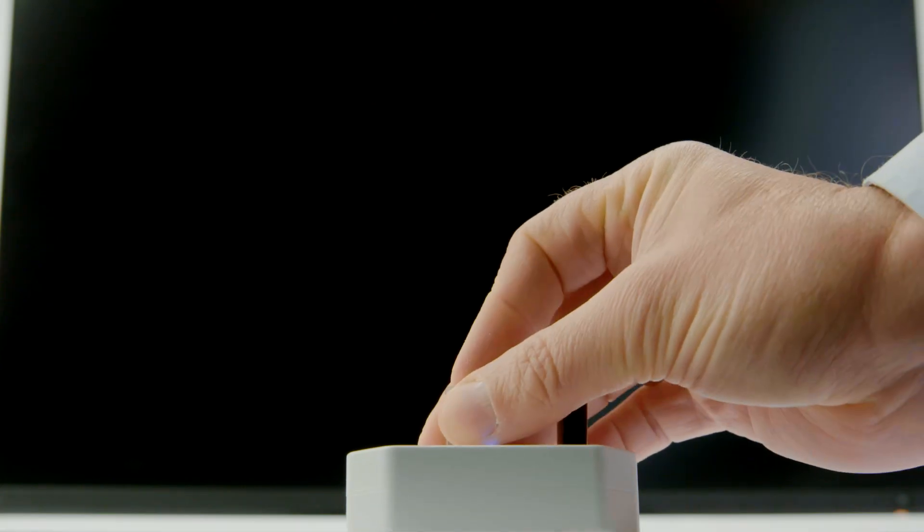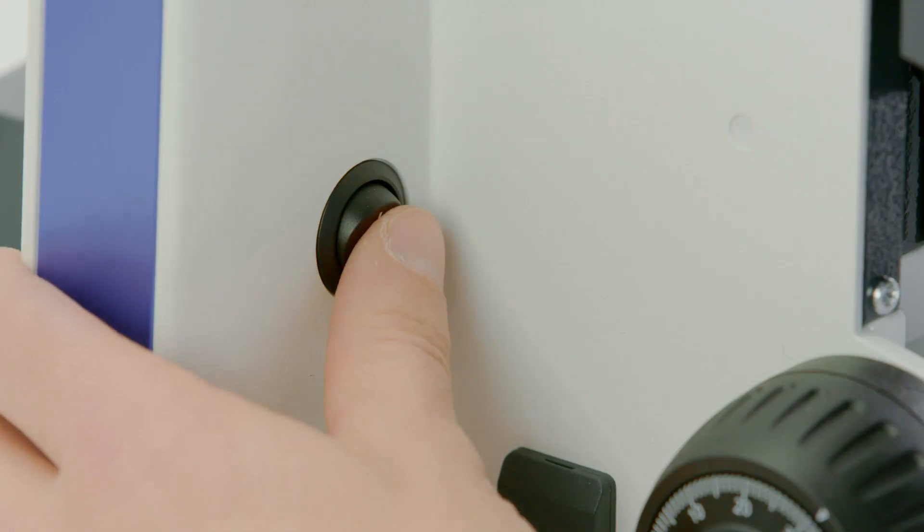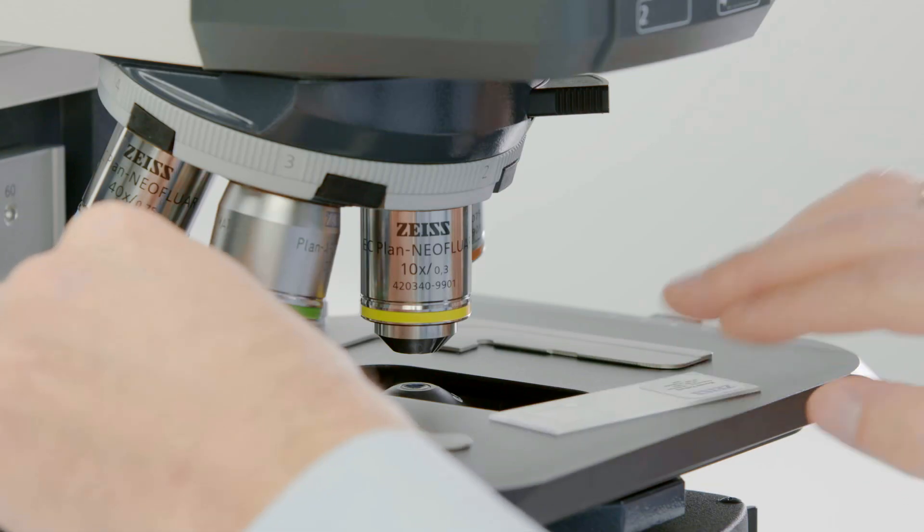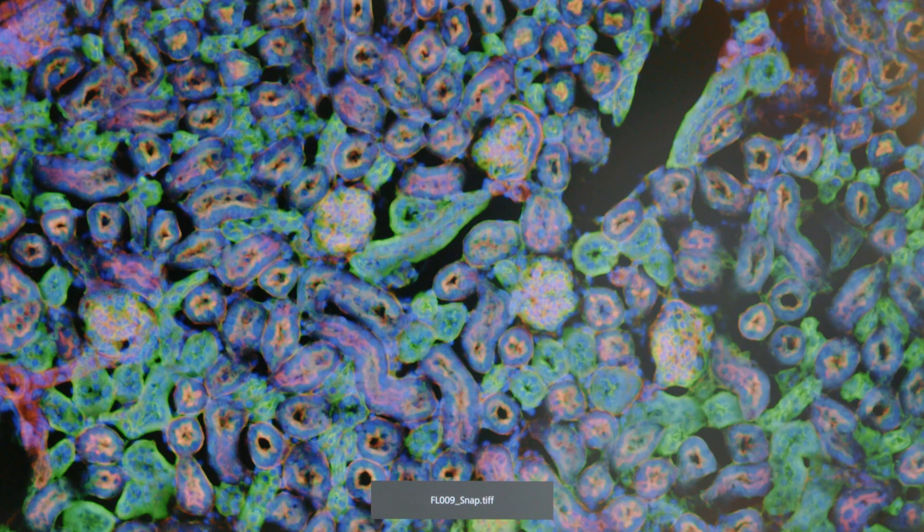Insert a USB stick into your smart AxioCam microscope camera. Switch on the microscope and place your sample on the stage. The sample shown is a mouse kidney section stained with DAPI, AF488, and AF568.